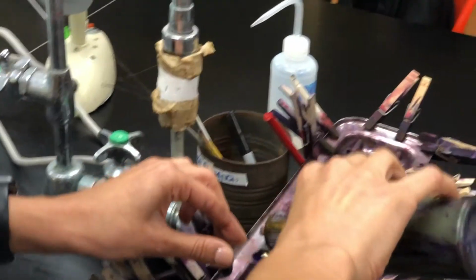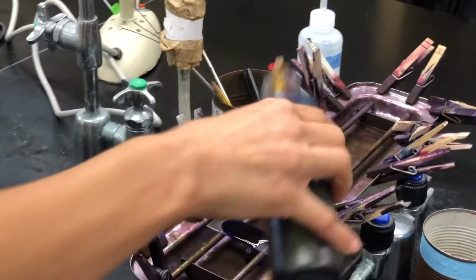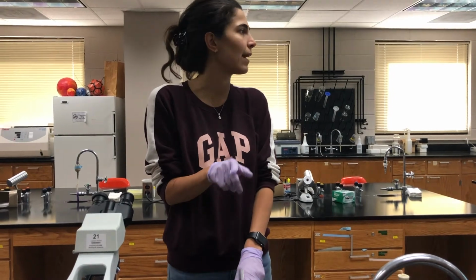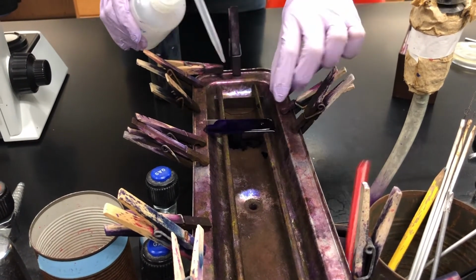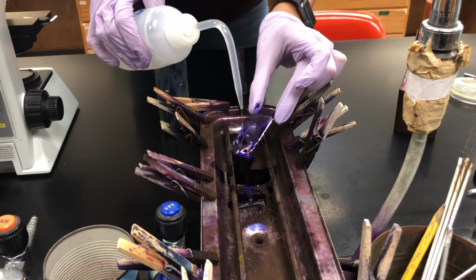Crystal violet. So I will put it here. It should be easier. Okay. Now 1 minute is done for adding the crystal violet. We need to rinse it with water. Like this.